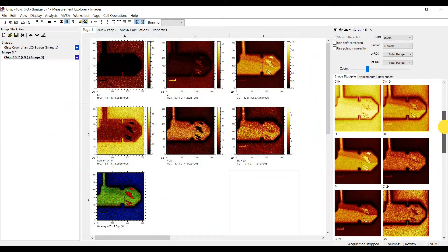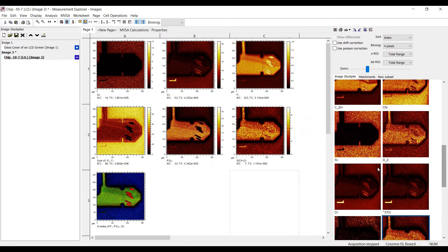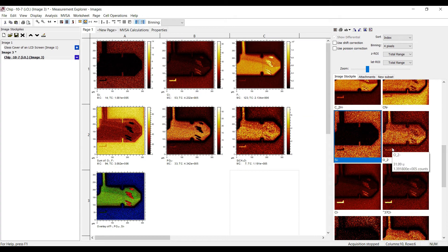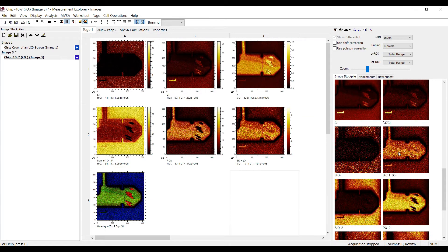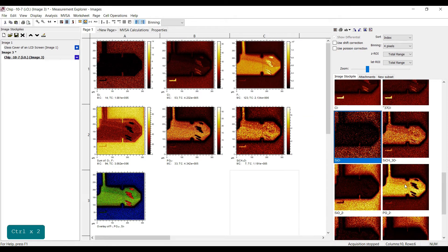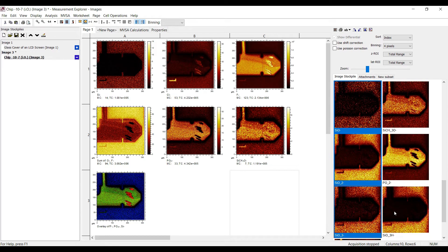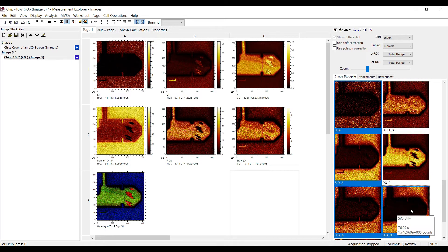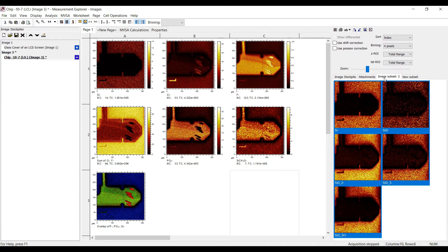Mass interval subsets are a new feature in SurfaceLab 7.1. You can use the subsets for example to group mass intervals which show a similar contrast in your image. Multi-select them in the image stockpile and drag them onto the new subset tab.